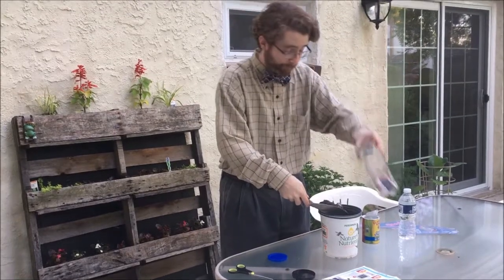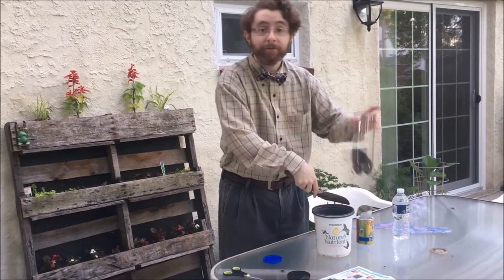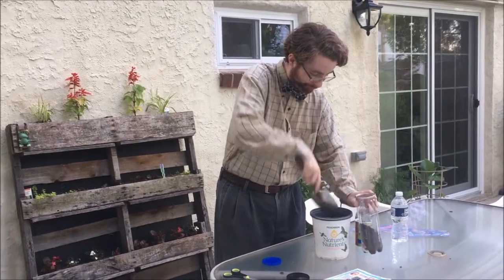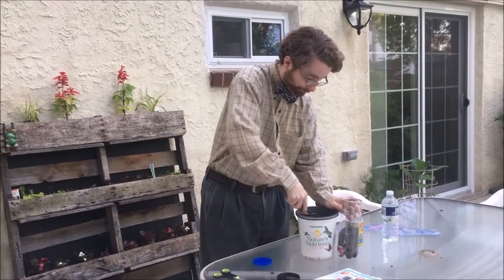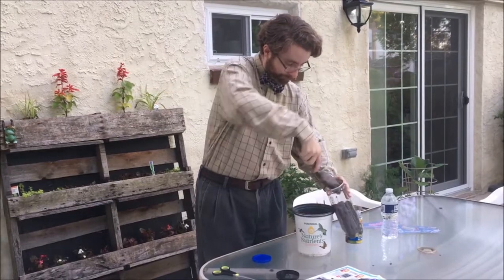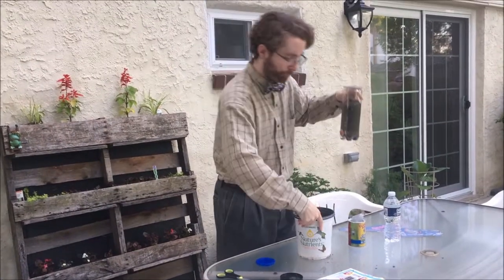And now we're going to start filling our container. It's a messy job, but someone's got to do it. You want to fill this up approximately three-quarters of the way. And pour. That looks good.